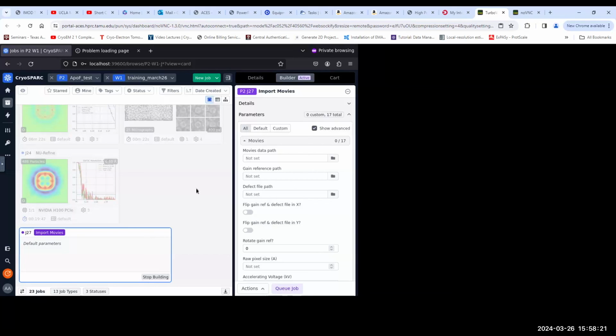So when you do the particle subtraction, you provide the larger mask to subtract. When you extract them, that density will be subtracted from the particle, and then you can reprocess the whole thing, do the whole procedure only for the part you want.